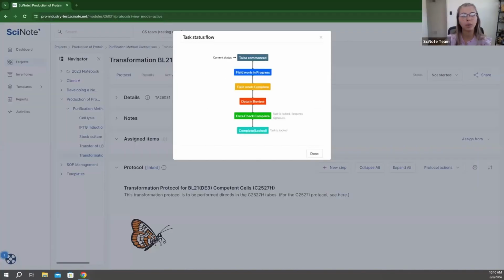So any other questions regarding custom reports or custom workflows? I just want to emphasize too, that the two examples I've talked about so far and the last example I'm going to go over are just one example. It all can depend on what it's going to look like for your team based off of your team's needs.